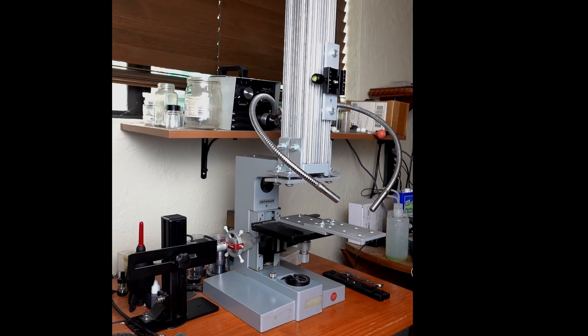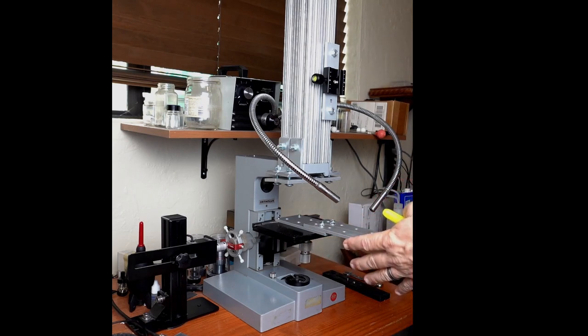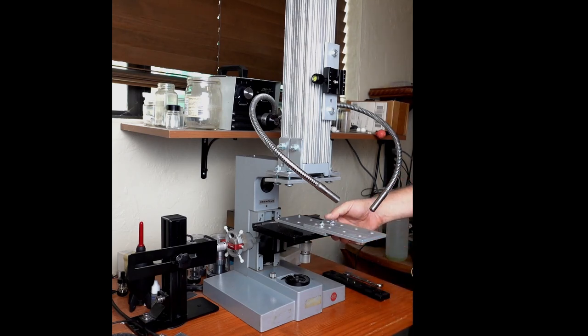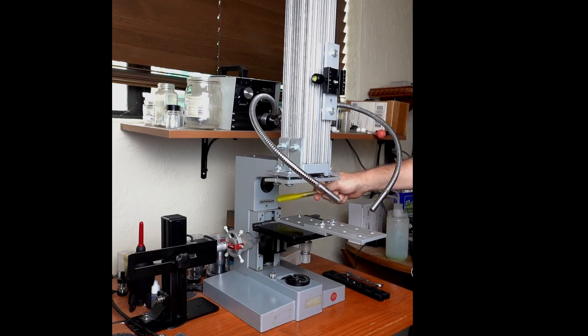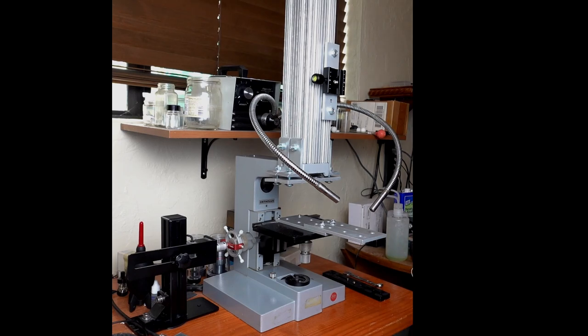To start with, I wanted to get XYZ control on a platform that's under the objective. A microscope stand is a really good way to do that because those tables have X, they have Y, and they have focusing built into them. And it's all very stable. So I looked on eBay and I bought a gutted Ortholux, Leitz Ortholux 2 stand. This is back when things were built really solid and heavy, which is what you want for this application.